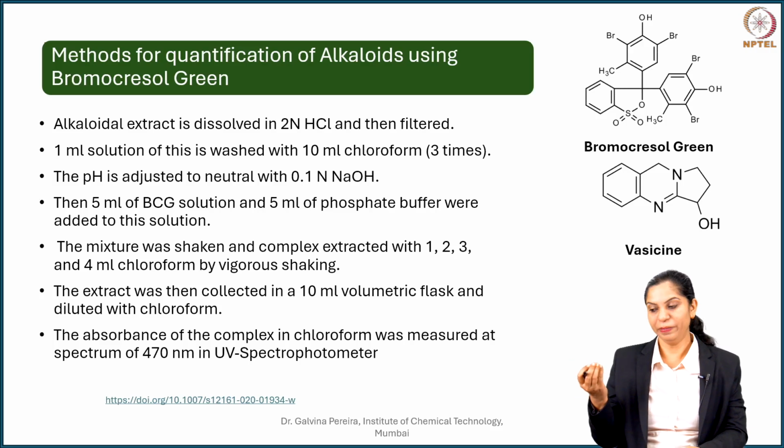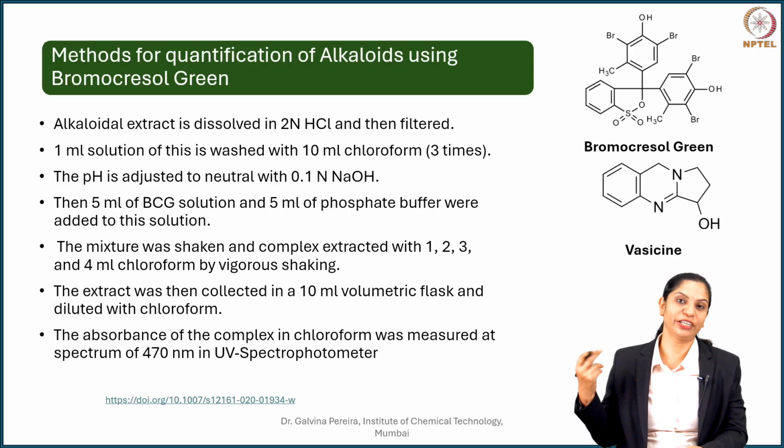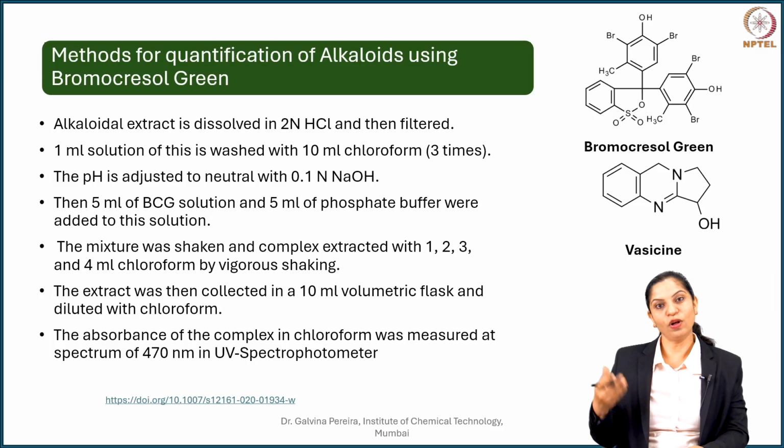Now once this ball mill has pulverized your drug to a very fine consistency, sometimes the drugs are sticky. So in that case, when your drugs or formulations are very sticky, they are frozen first using a deep freezer to about -20 to -30 degrees Celsius, and then that cold ice preparation is subjected to ball mill to get a fine powder. This is then extracted with about 2 normal HCl 2-3 times, so that all the alkaloids get converted into alkaloidal salts and then they occur in the solution.